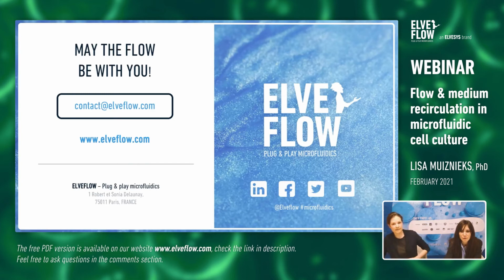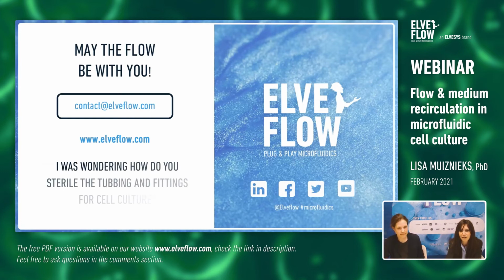Okay, so from Shojaish: Thank you, Lisa, for the very attractive presentation. As it's going to be used for cell culture, I was wondering how do you sterilize the tubing and fittings for cell culture?